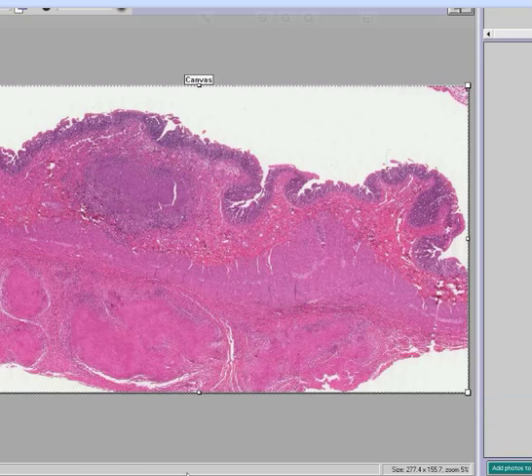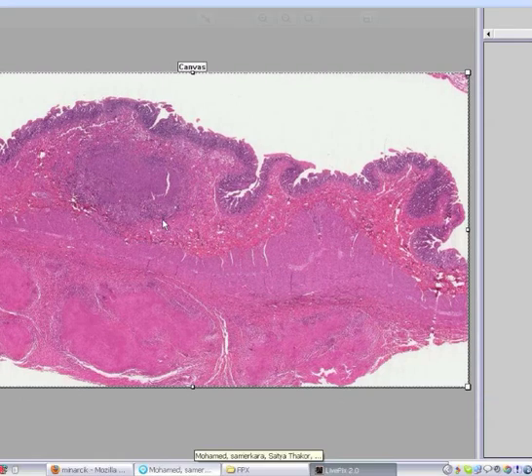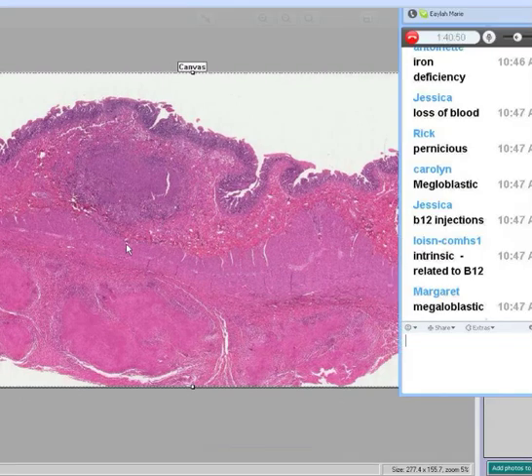And guess what, folks? I'll spare you half of the guesswork here. I think I could convince you pretty easily this is a stomach. I think you could see a mucosa on the top. I think you could see a pretty nice hemorrhagic vascular submucosa. I think you could see a nice little thick line of muscle. And then I think you could see a serosa here. So the easy part is this is a stomach.